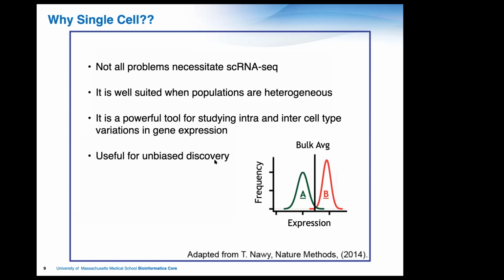If you contrast that with single cell, in single cell, you don't have to have any prior notions about what might be in your data. You don't have to expect a T cell. You don't have to expect a macrophage and design a panel based on those expectations. Instead, you can just, in an unbiased way, take your whole single cell suspension, run it through single cell, and you will read out the transcriptome of all of those cells and be able to use that to build up a map of whatever sample it is that you're working with.